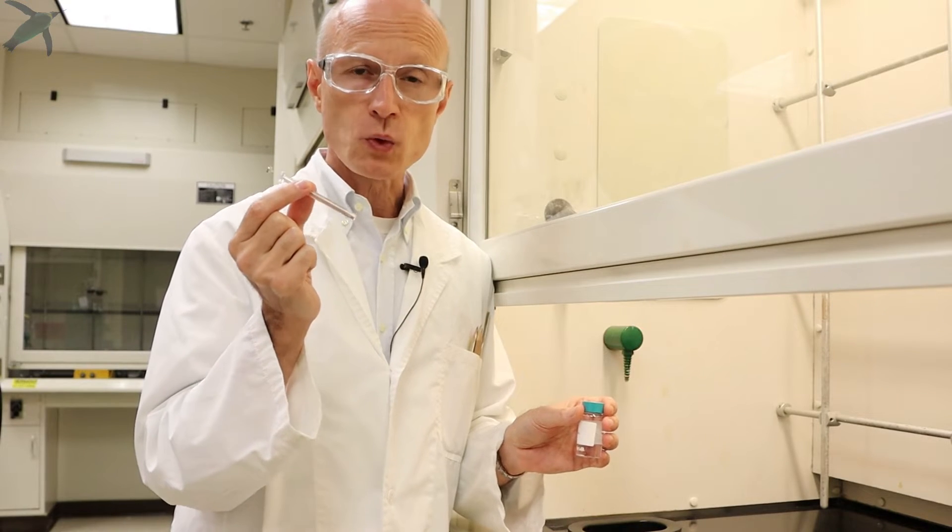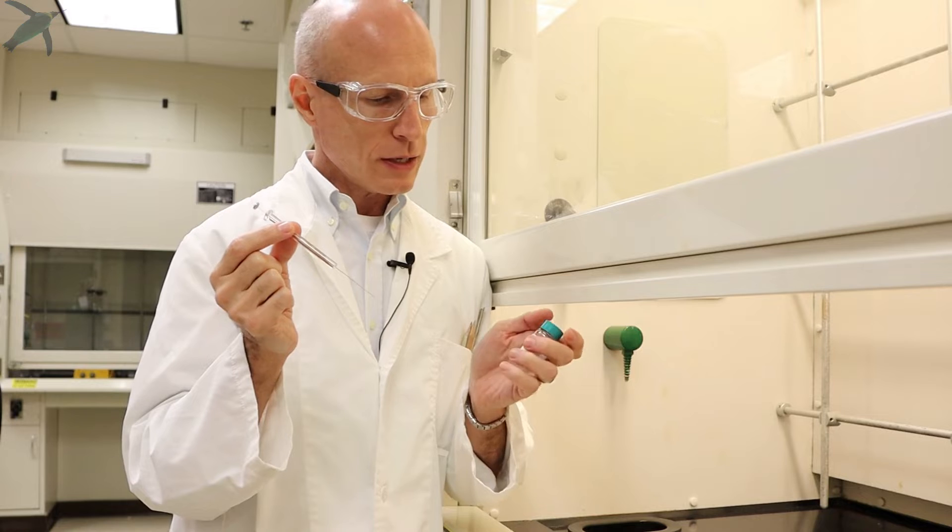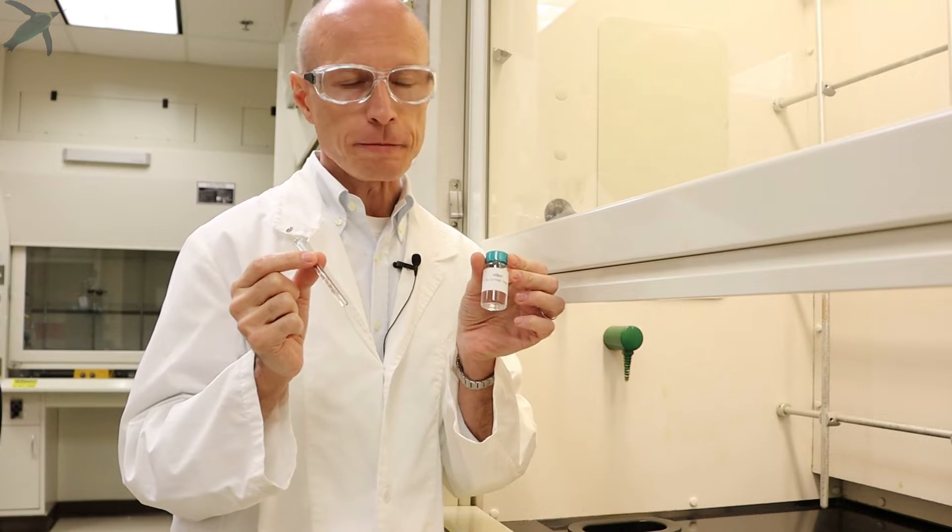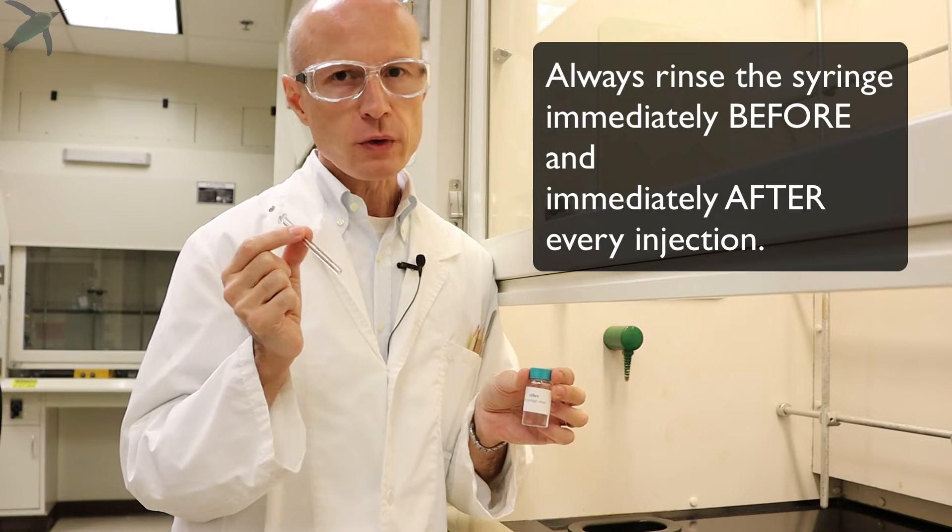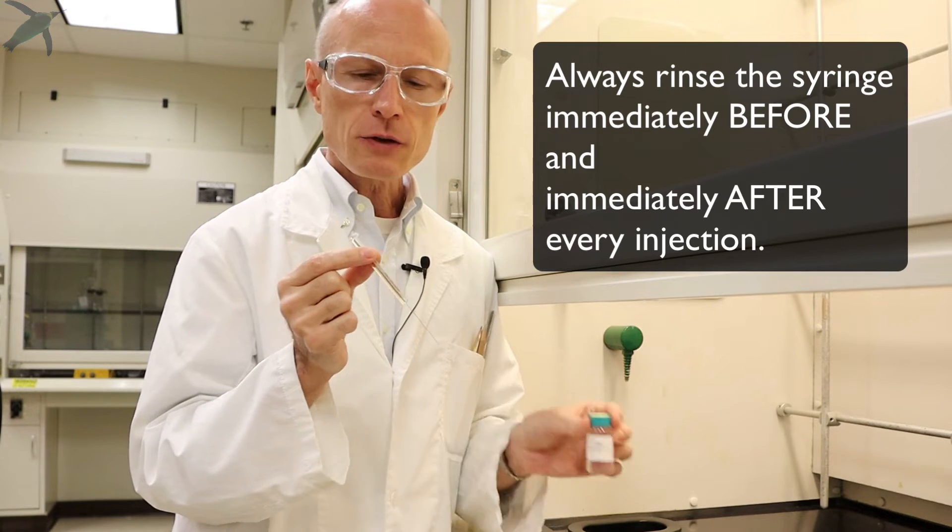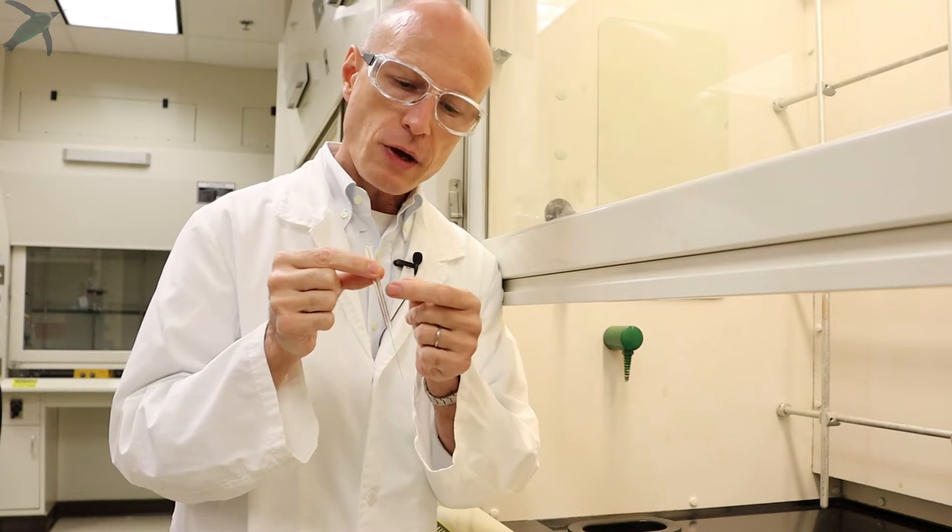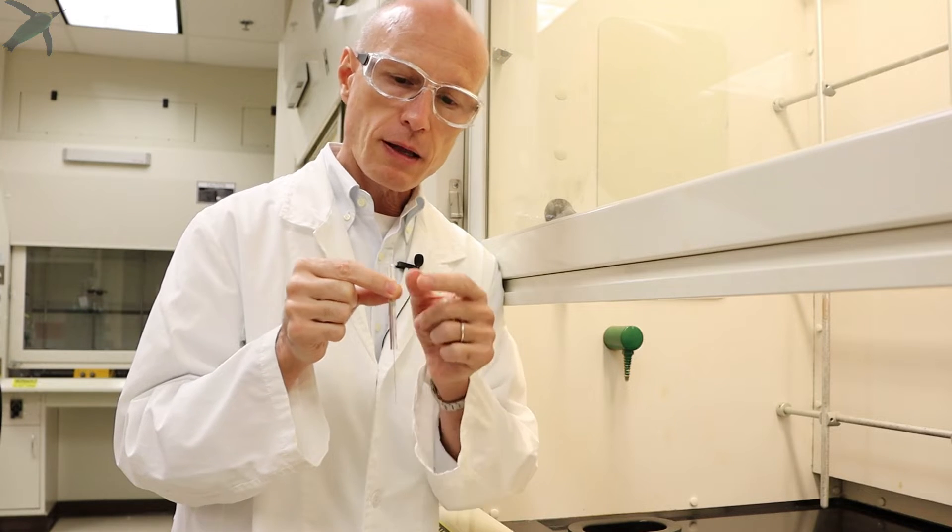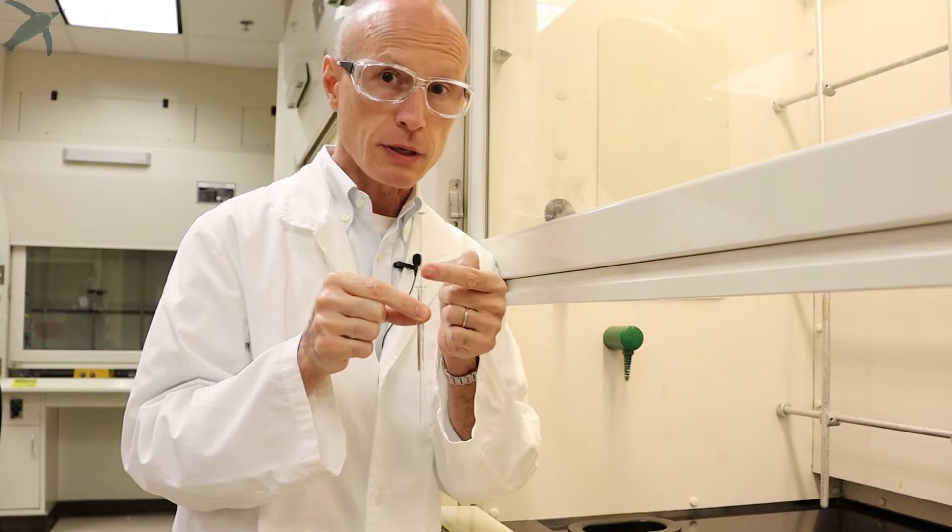The first thing you want to do is rinse the syringe, normally with an organic solvent like ether. You want to do this for two reasons: obviously because you want your syringe to be clean, and second because you have a glass barrel and stainless steel plunger.